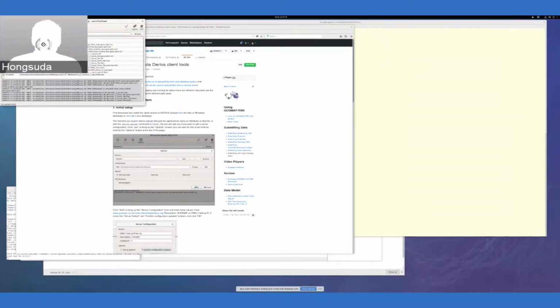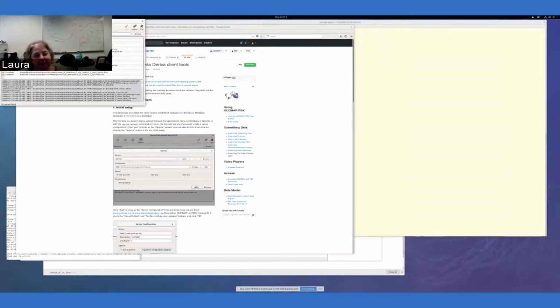Okay, so you'll see that these are all complete, which means that either the files were uploaded or this could be a restart of a previous upload. The other thing that it will do is checksum the file itself and see whether the file is there or not. If the file is there, it's not going to re-upload it. It's just going to say, oh, okay, it's already there, and move on to the next.